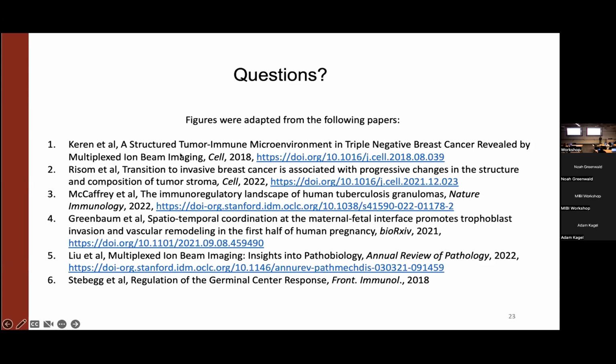This could get a bit difficult if it's a very rare cell population, because it would be really hard to assess what the null distribution is just out of permutations. But this is just a difficult question, like what happens with very rare cell types. So I don't know.